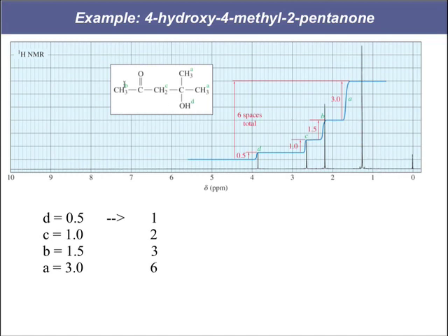Now we've got to choose between our B and our C. Notice that they are both methyl ketones. Their default position should be about 2.1. But notice that these are different. The C hydrogens are closer to this oxygen over here than our B hydrogens are. So these are both in proximity to the ketone, and that's what's going to put them at 2. But our C's are going to be pulled a little bit more downfield because they're closer to our oxygen.